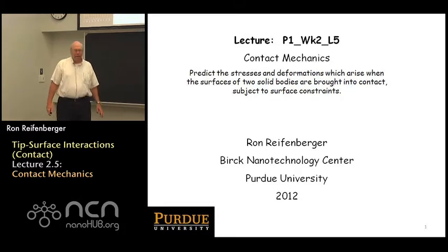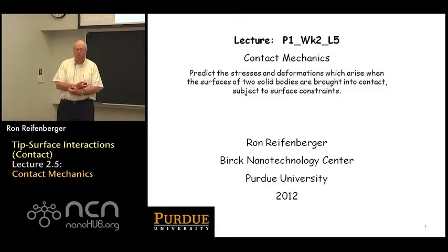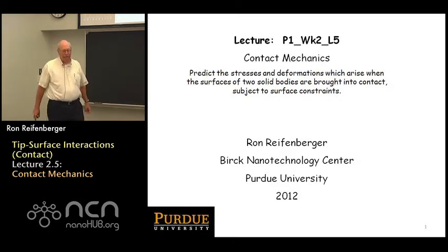Hi, we're back again. This is lecture 5 of week 2. And in this particular lecture, we're going to try to summarize some of the important results for contact mechanics. And these results will be very useful in trying to describe how a tip comes into contact with a substrate. So, you know, it's useful to have some broad overview of what contact mechanics is.